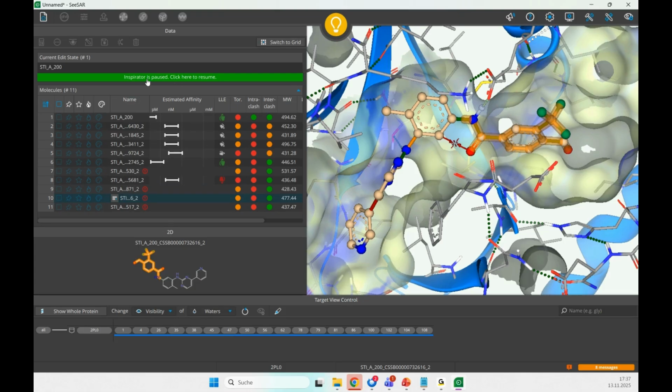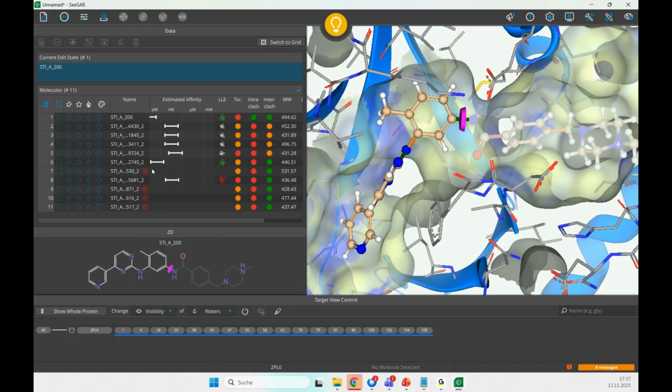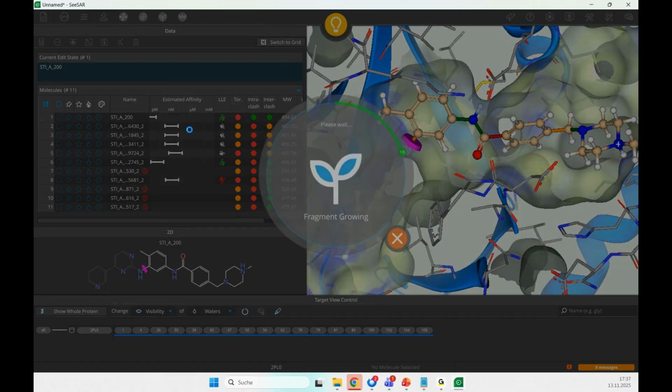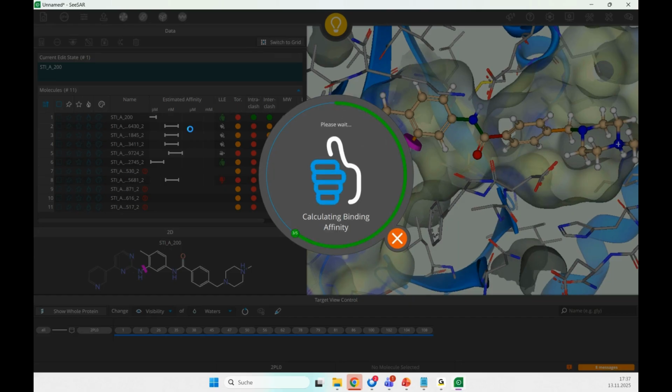We also see very nice decorations, also complementing intramolecular H bonds. And again, if you're not satisfied with the results, you can always guide your searches by applying pharmacophore constraints. This is FastGrow. Again, I will quickly get rid of the results here.